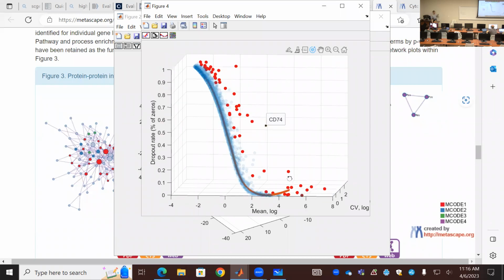So this method is data driven, okay? It only depends on the majority of genes and what shape it is. Your sample may have a different curve shape from that sample, but it doesn't matter. You only consider all the genes you measured in this particular sample.